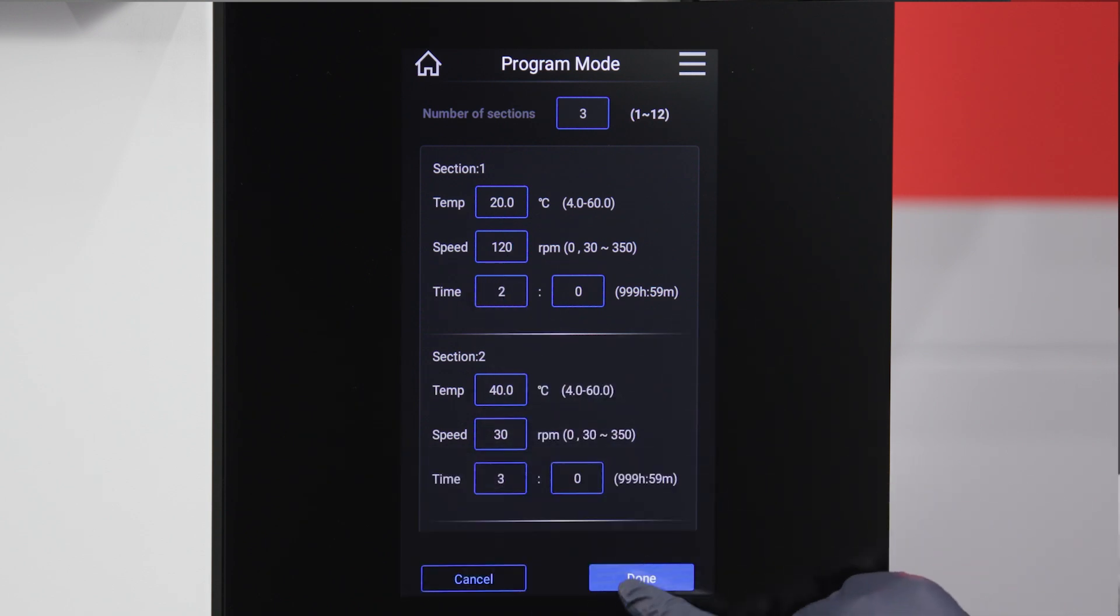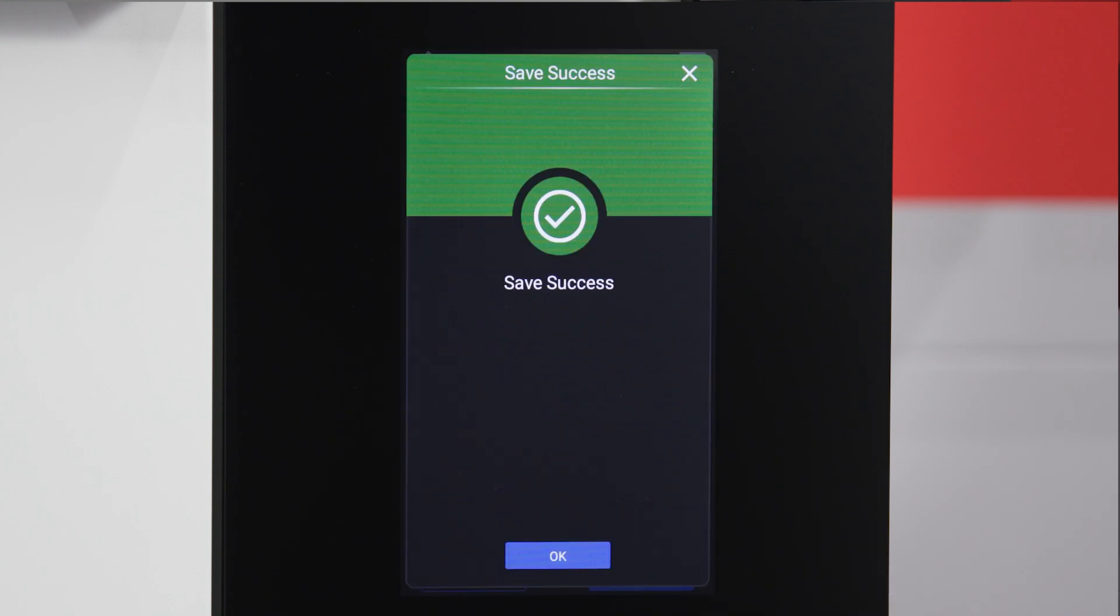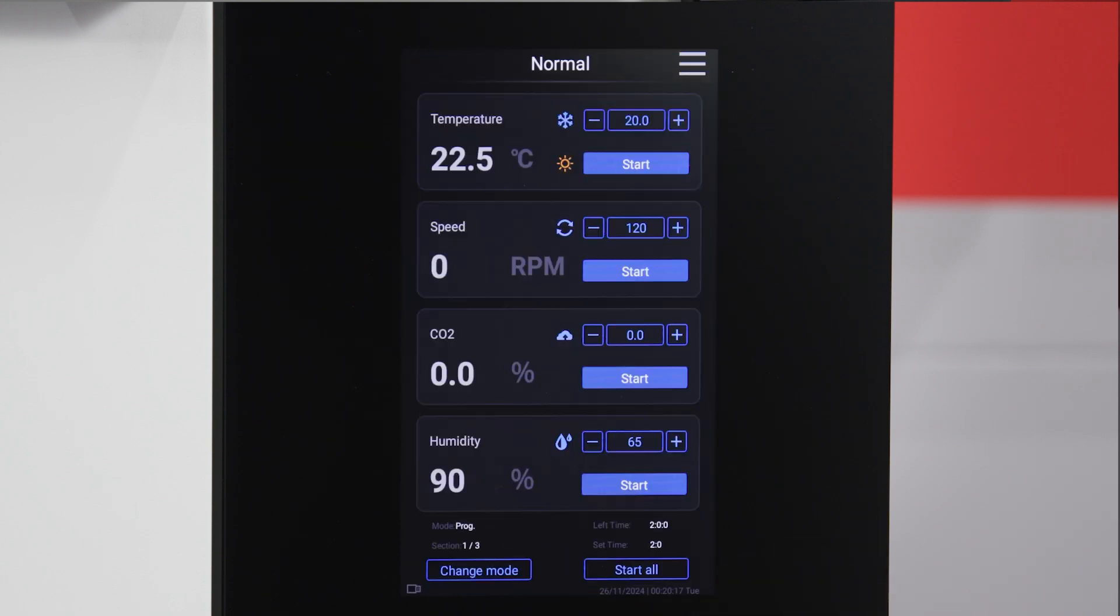Tap the done button to finalize your settings. Note that the program mode only controls the time, temperature, and speed of the shaker. CO2 and humidity concentrations are controlled from the main interface.